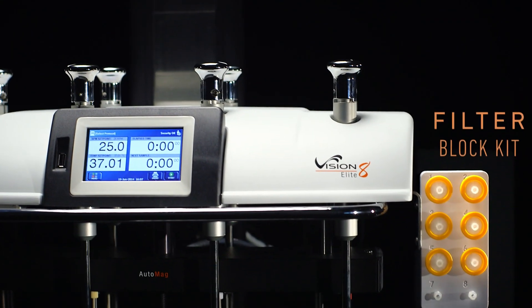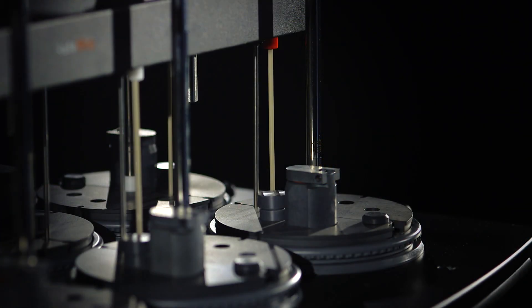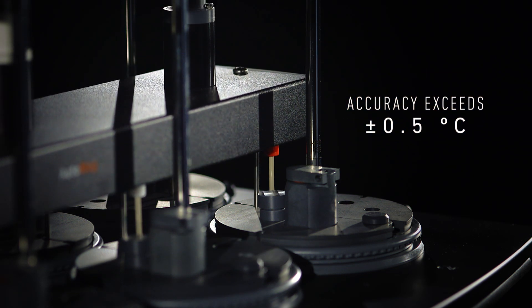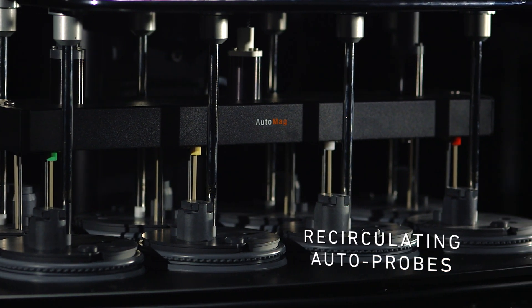An inline filter block kit is available for both manual and automated sampling. Digital temperature probes give feedback within milliseconds, providing accuracy that exceeds the published USP specification of plus or minus 0.5 degrees Celsius. Automated probes reduce the hydrodynamic interferences typically caused by stationary probes. Optional recirculating auto probes will return media back to the vessels.